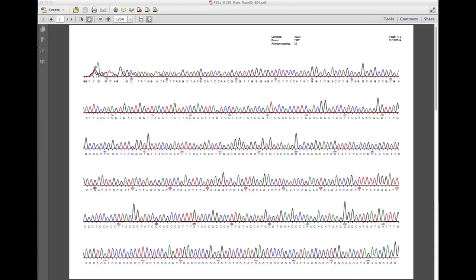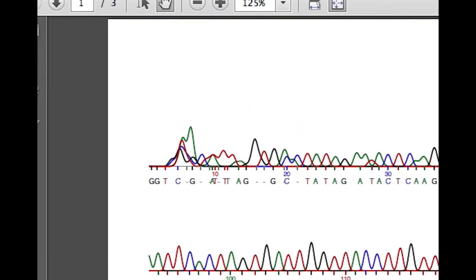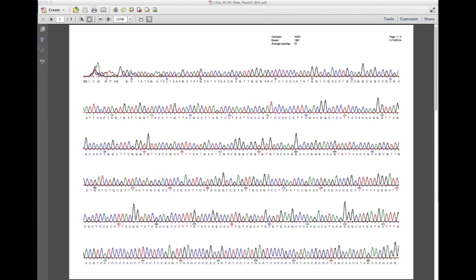As you can see, the beginning of the sequence is unclear, since the peaks on the chromatogram are lower and sometimes two peaks overlap. Therefore, we'll only be able to rely on the accuracy of the sequence in the sections where there are tall and distinct peaks.